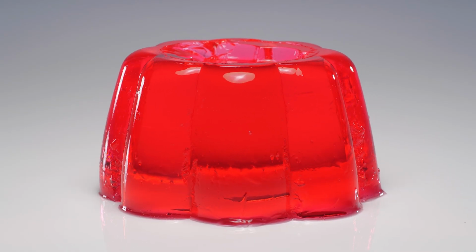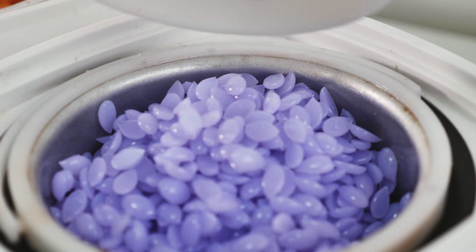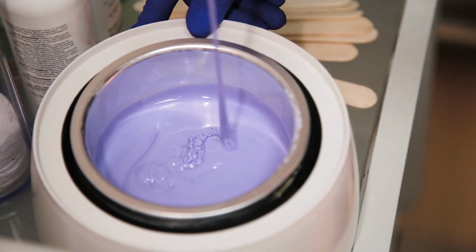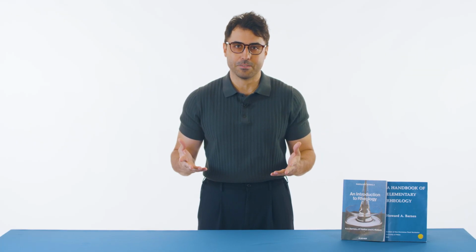Think of something like a gelatin dessert or wax. At lower temperatures, it's firm, storage modulus is high, and the material behaves like a solid. But as we heat it up, the structure starts to soften, storage modulus drops, loss modulus may rise, and the material becomes more fluid-like. Temperature sweeps are like turning up the heat and watching the material reveal its limits.